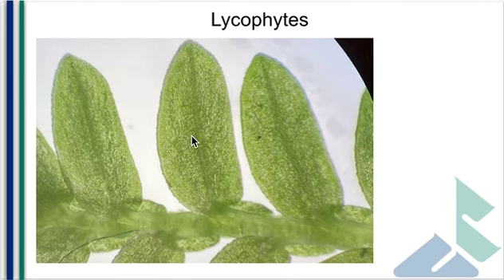Now there are some lycophytes that have extremely long leaves, but none of them have wide leaves because of the rules of diffusion. You cannot get resources, you cannot get water very far with veins that are not branched. I'd also like to point out the absolute behemoth of cells that these leaves are made of. You can see them under the dissecting microscope.